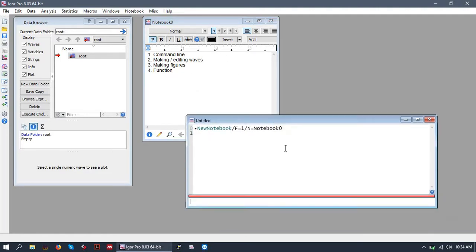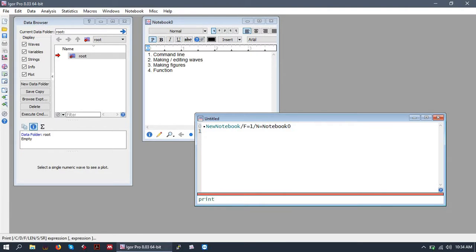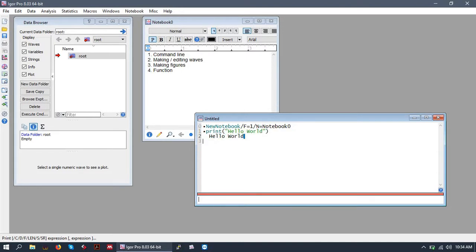So the command line or command window is a way for the user to interact with Igor. So this is done through commands, operations, functions, et cetera. For example, let's tell Igor to print the string hello world. So we gave Igor an input of print hello world and it output hello world.